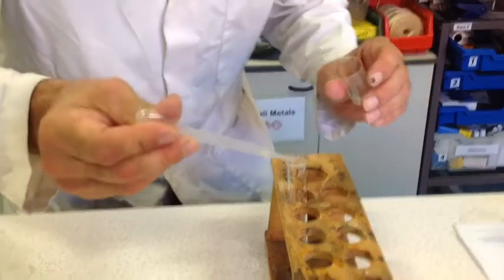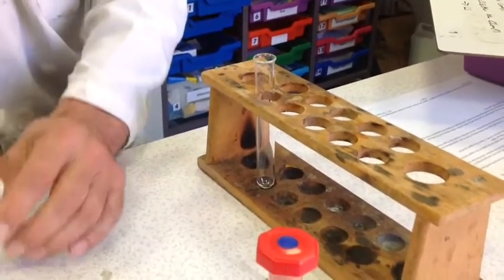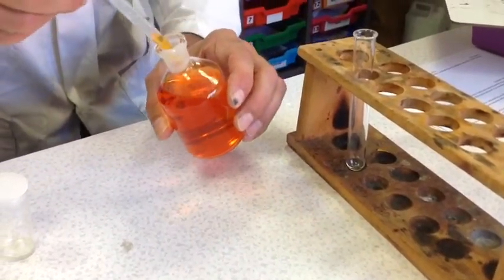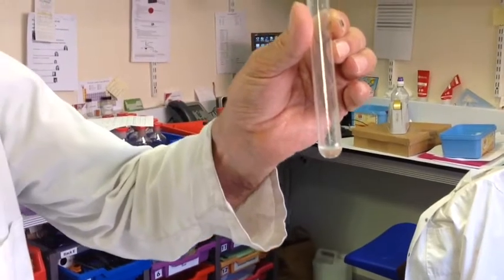Okay, you will then go on to test your cyclohexene with bromine water. This next stage will be carried out in a fume cupboard. So what we want to do is add a couple of drops of your cyclohexene into a test tube. We'll then add a small volume of bromine water, and if you have produced cyclohexene, the bromine water should decolorize. Which it has. Ta-da!